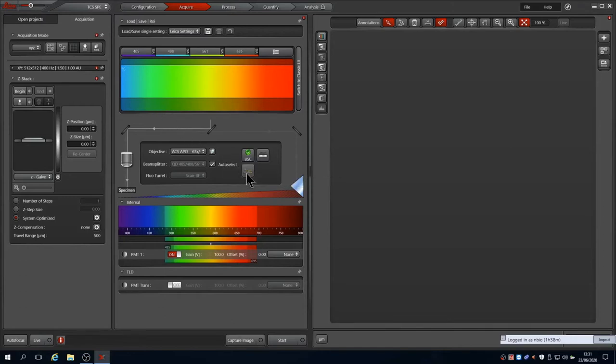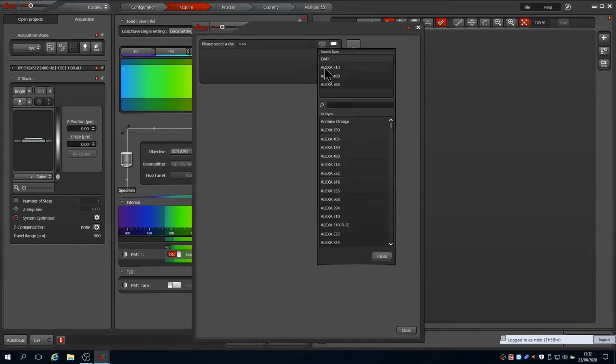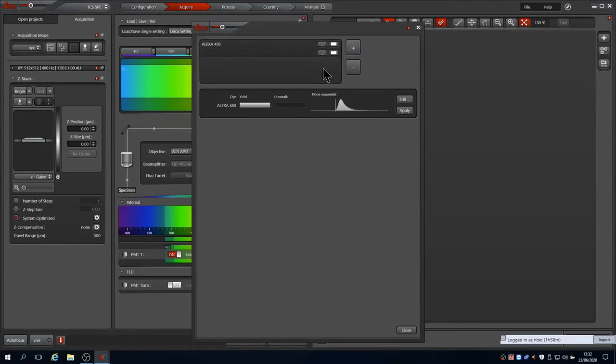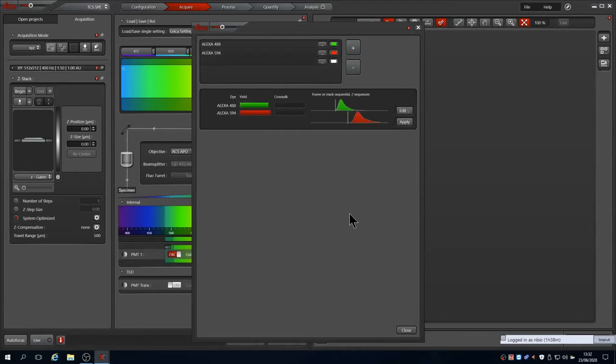The simplest way to configure the system is to use the dye assistant. Clicking this opens another window. Click the dot dot dot icon to open a choice of dyes. Choose the fluorophore you have stained your sample with. If you have more than one, repeat for a second line. You can stack multiple fluorophores and can easily separate four in the system, more if you are careful with your choices.